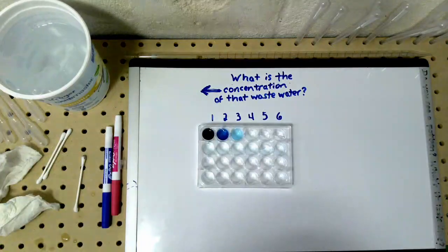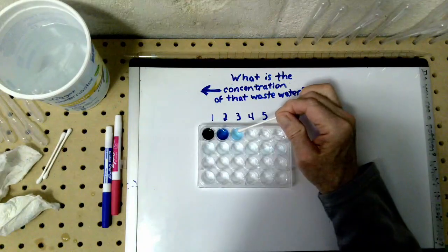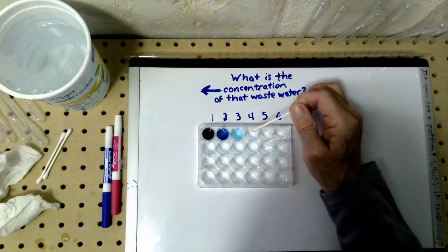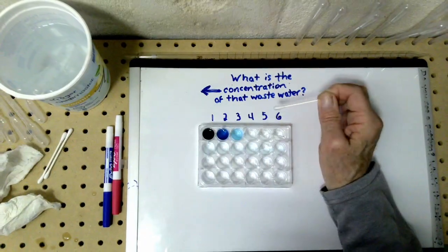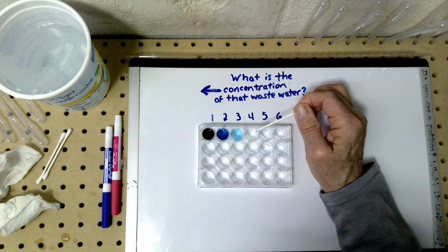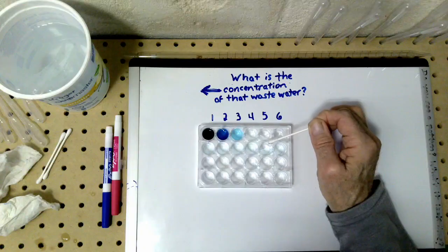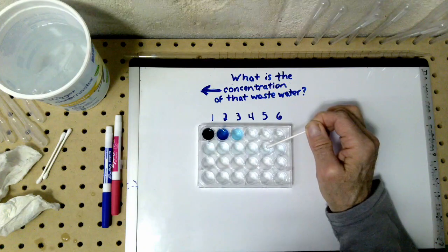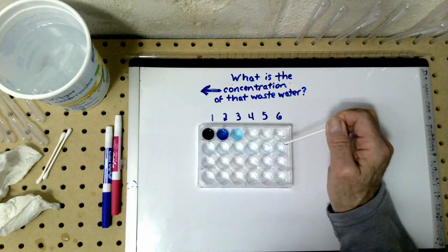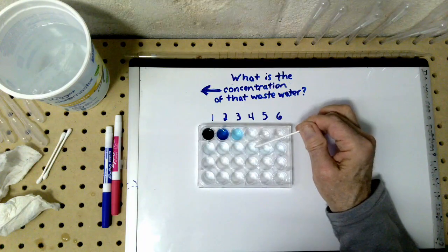Where do I point with this? This right here, little darker than that. This one, that's a tough one. It almost looks like that one. Here, I think I see a little tinge of blue here compared to that. Similarly right there. I'm going to go with the 4.